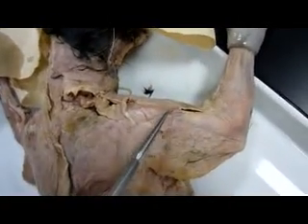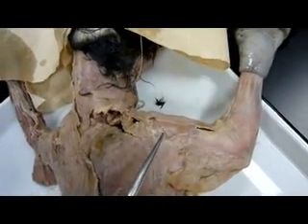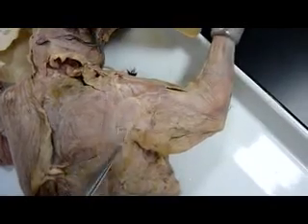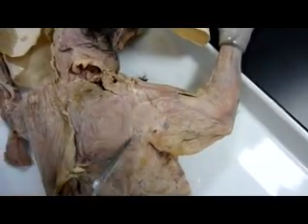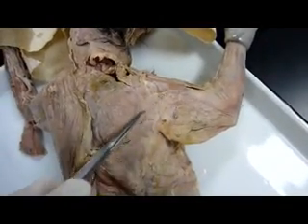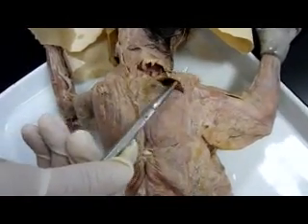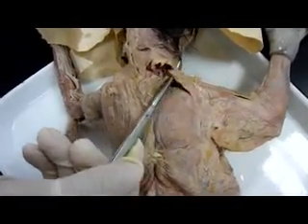The acromiodeltoid is this. The spinodeltoid is this — we need to clean that up. And then this is the levator scapula ventralis.